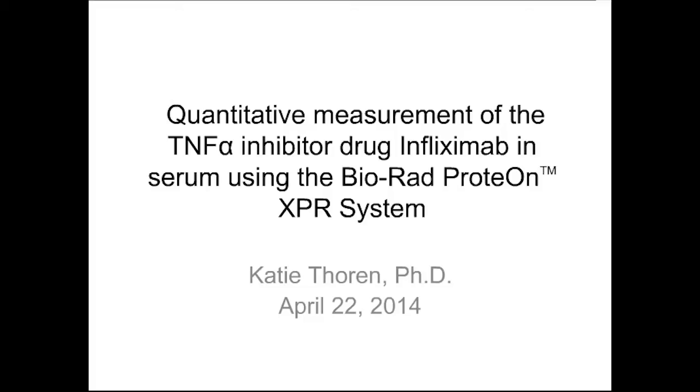In today's webinar, she will be telling us about her work on quantitating the TNF-alpha inhibitor drug infliximab in serum using SPR technology.